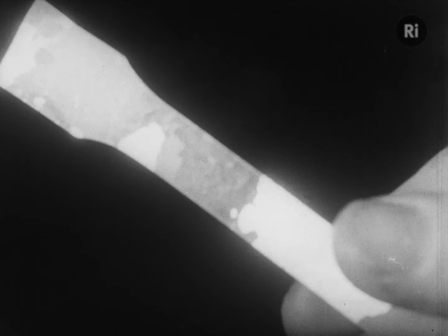All metals like this piece of aluminium are crystalline, the essential features of a crystal being that its atoms are in regular patterns. This is not always apparent in an ordinary piece of metal, but if we etch it with an acid, regular pits are formed and the light glinting on these pits shows the crystals.